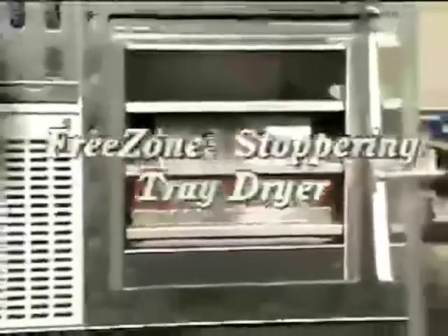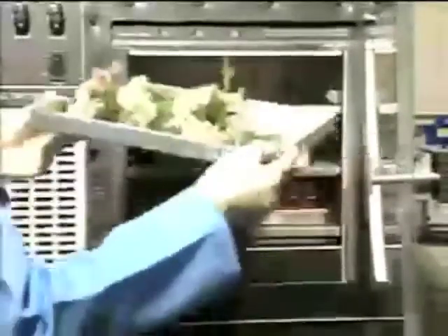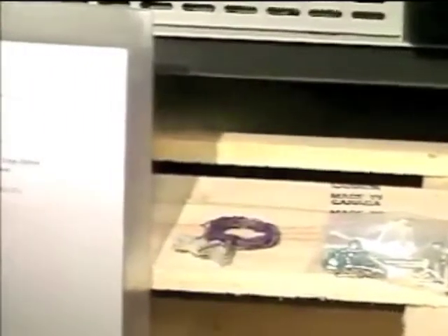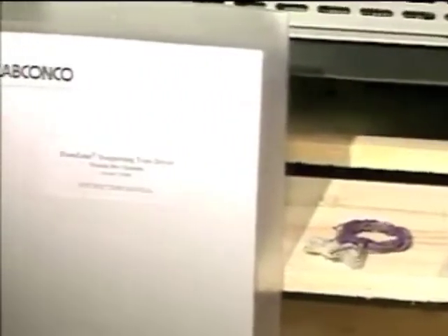The FreeZone Stopper Ring Tray Dryer allows drying and sealing under vacuum of numerous small samples in bottles or vials, or large specimens in bulk. Your tray dryer includes a power cord and a plug for connecting to a dedicated circuit, fasteners for attaching the tray dryer to the freeze dryer, three temperature probes, and an instruction manual.